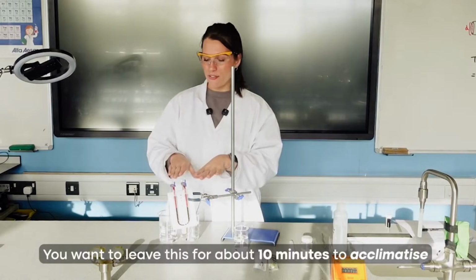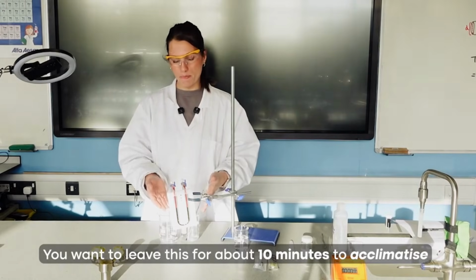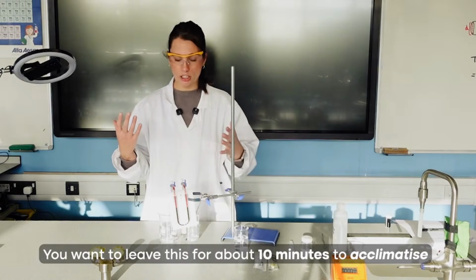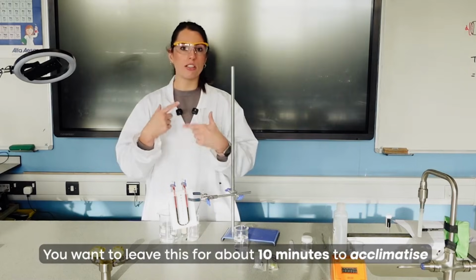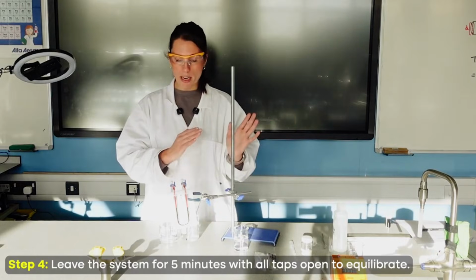Now you want to leave this for about 10 minutes to acclimatize. And by that we mean reach this temperature, allow those chambers to fill with gas, let the gases expand as well, because this is all to do with pressure changes. And also for the yeast to reach that current rate of respiration. So we do need to get it all set up, leave it for about 5 minutes, and then we will measure it as we go.